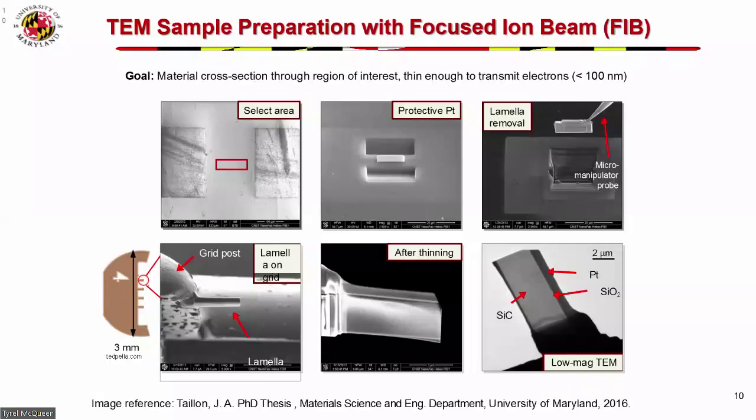And that's the scariest part, because it can touch something and then it goes flying. So you lose a lot of samples along the way. And then the grid is sitting like this in another part of the chamber, and you bring the nanomanipulator and just gently touch the other end of the sample, this edge, to one of the posts. This would be rotated with the fingers like this. And then you bring it like just barely touch.